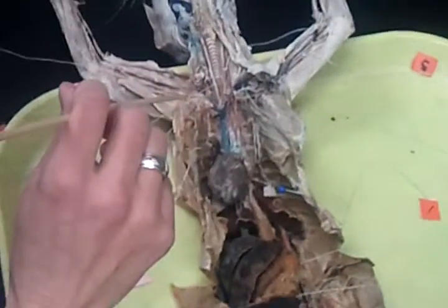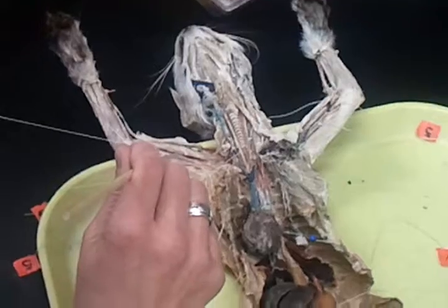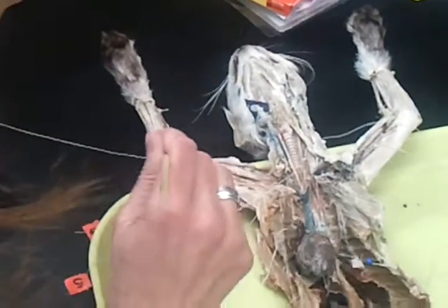Coming out of the armpit region, going into the upper arm, we call this the brachial artery. Now if we follow this down to the lower arm, the brachial artery would split into a radial and an ulnar artery, but we're not doing those on the cat.